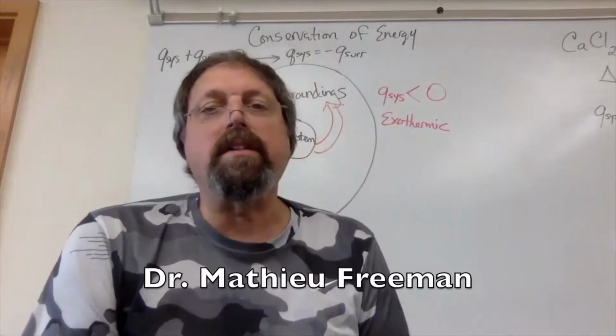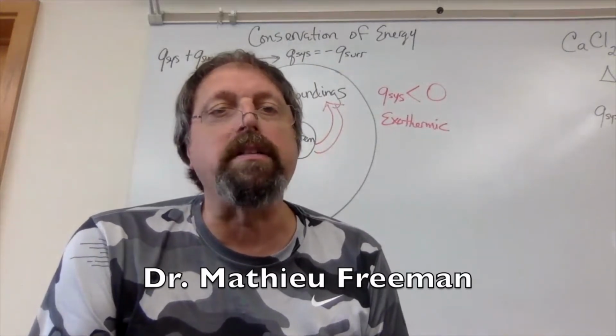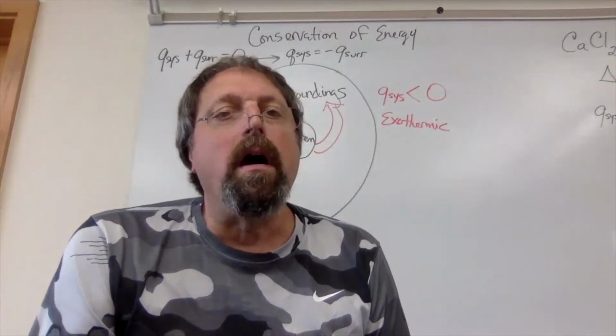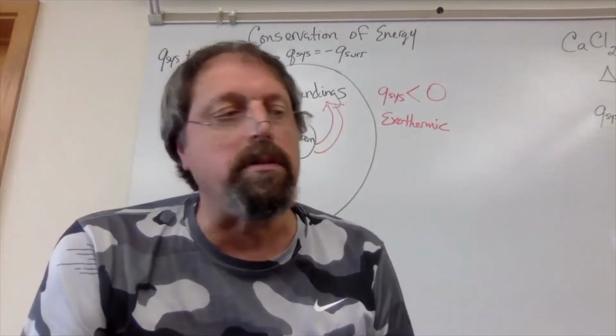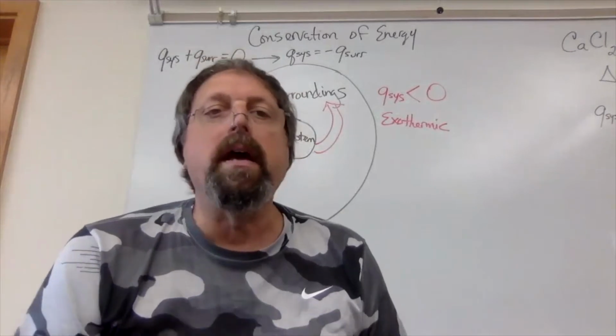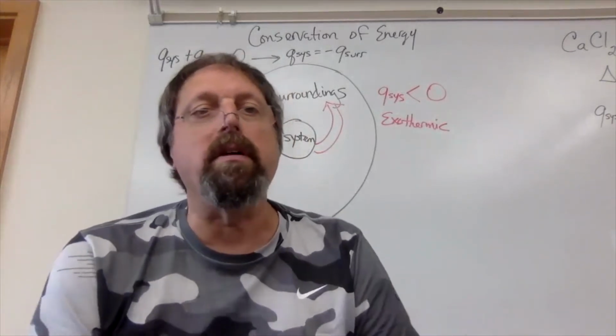My name is Dr. Freeman. I'm a chemistry teacher and research director at Greens Farms Academy here in Connecticut. And my friend Lila Wells asked me to do a video on heat. And so I thought I would do a little simple reaction and show you the equipment and some of the calculations, and then start off with a little bit of background.